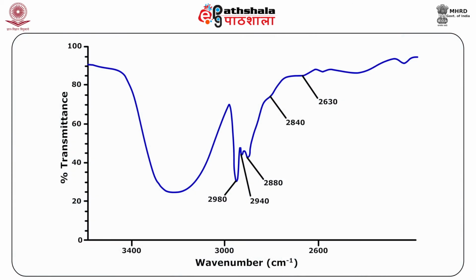For example, the Intoxilyzer 5000 measures the intensity of absorption at the 5 frequencies which are shown here in the figure. Now, this is an IR spectrum of a breath sample. The concentration of ethanol in the sample can actually be calculated based on the intensities of these signals obtained from the Intoxilyzer. Now you can see how helpful IR spectroscopy is, not only for the organic chemists but also for others. Next use of IR spectroscopy is in the identification of primary, secondary and tertiary amines.